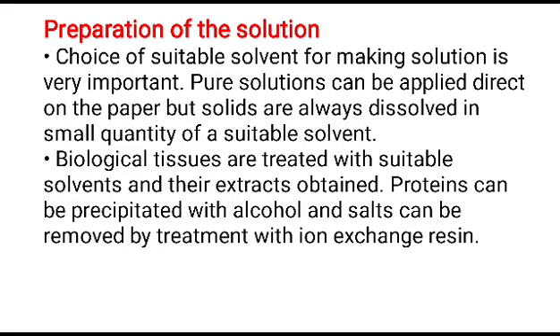Then preparation of solution. The choice of a suitable solvent for making the solution is very important. Pure solutions can be applied directly on the paper, but solids are always dissolved in a small quantity of suitable solvent. Biological tissues are treated with suitable solvent and their extracts are obtained. Protein can be precipitated with alcohol and salt can be removed by treatment with ion exchange resins.